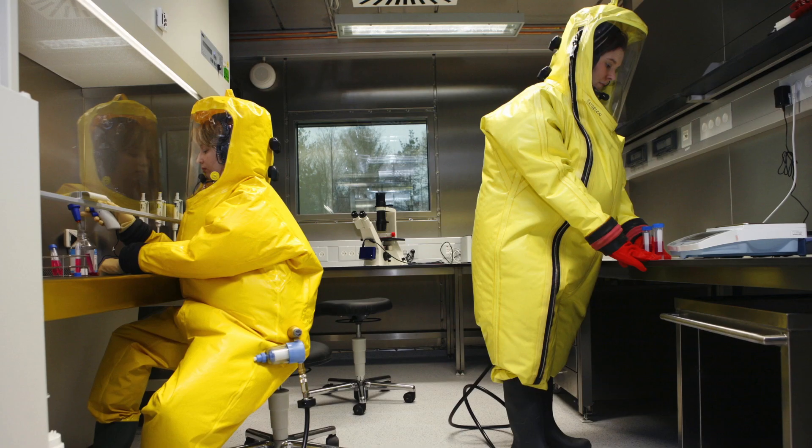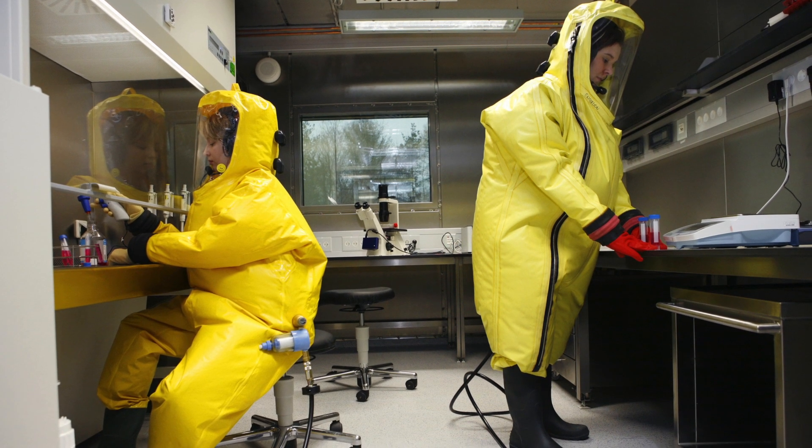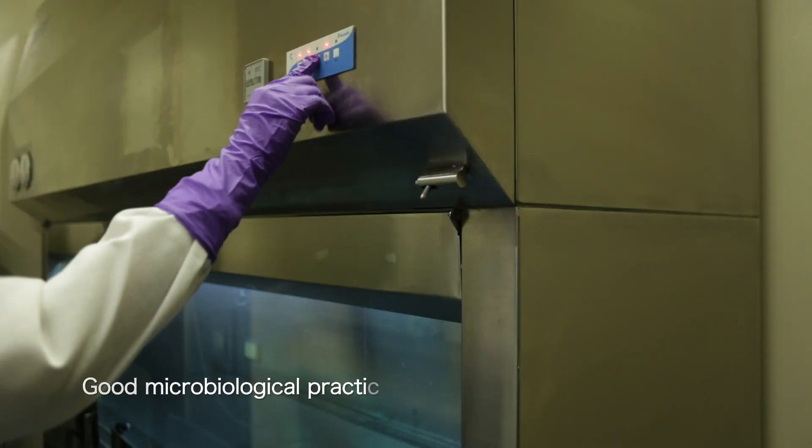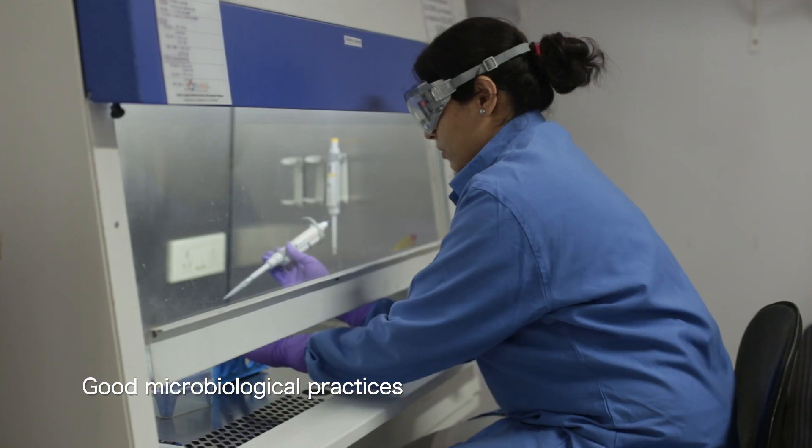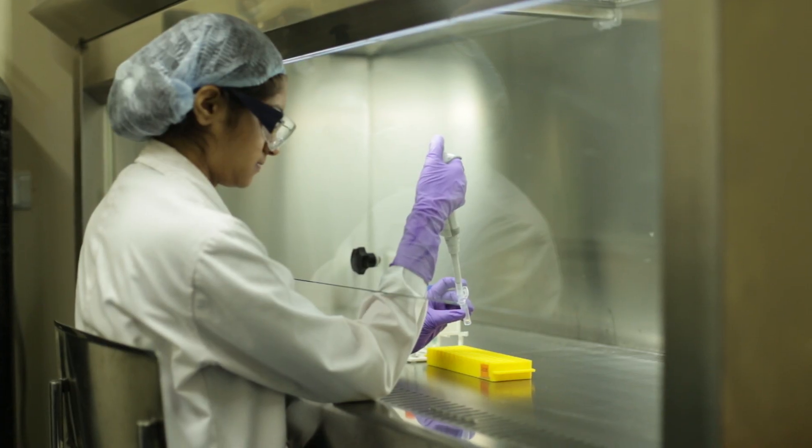BSL4 provides the maximum containment and is used for handling agents which cause fatal infections and for which treatment is not available. We will now see some of the good microbiological techniques to be followed while working in the laboratory.